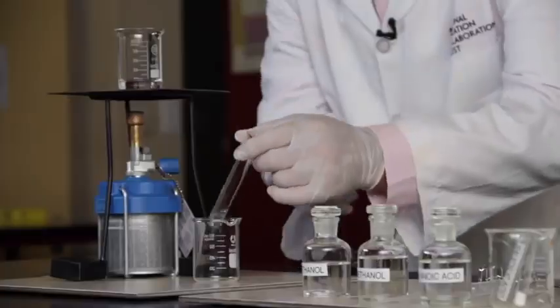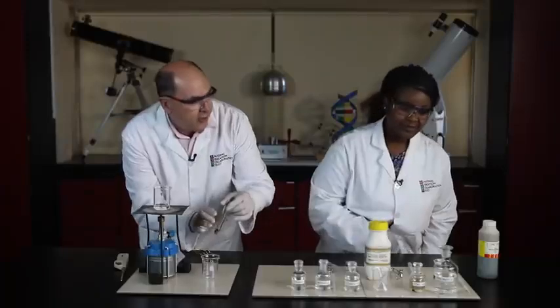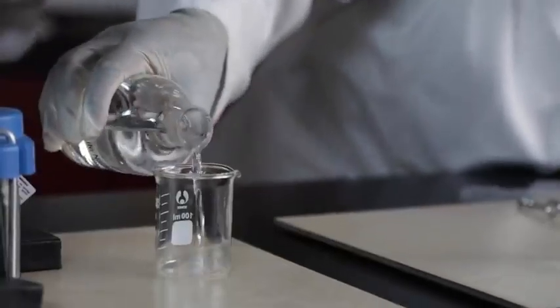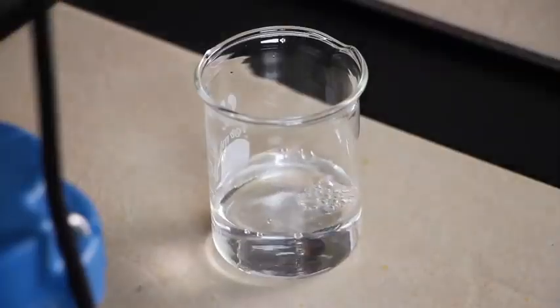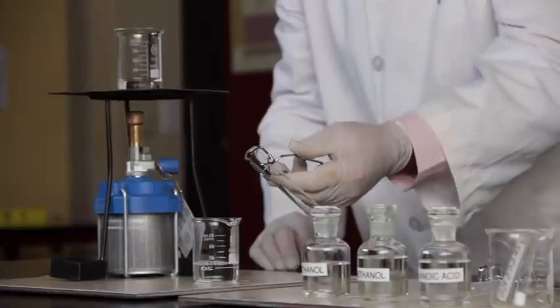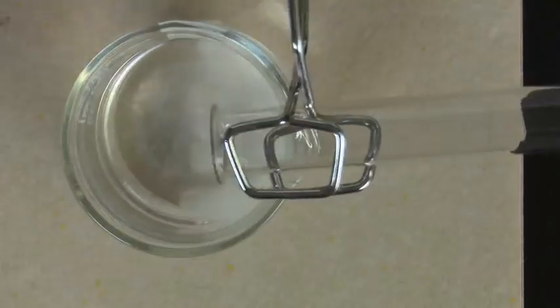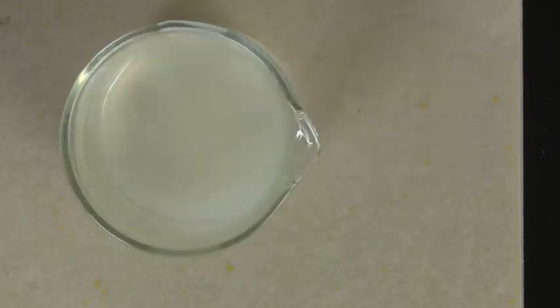Right, let's check. This reaction mixture has cooled down nicely. So let's get ready. Let's add dilute sodium carbonate in here. And now I'm going to pour in the reaction mixture. Oh, isn't that great? Right. Let's stir a bit.